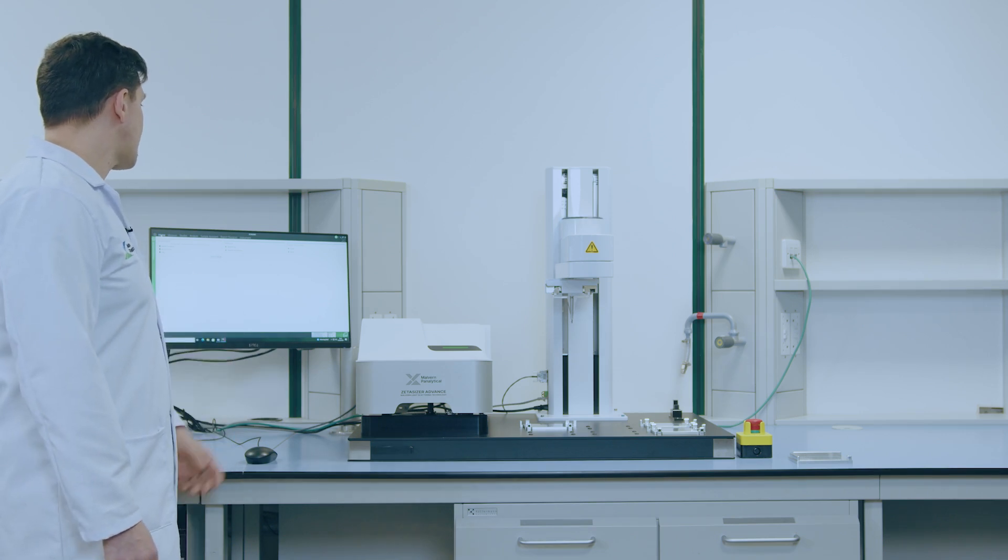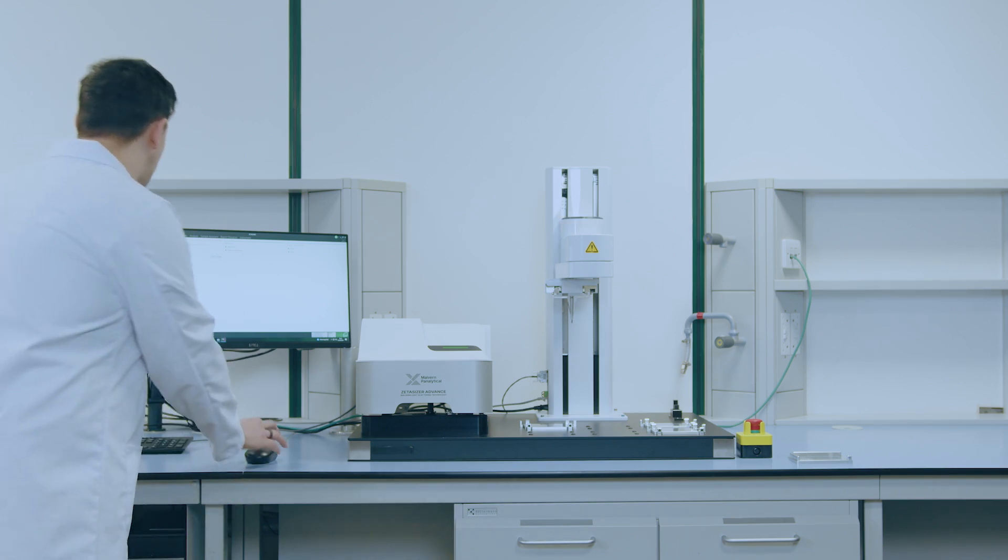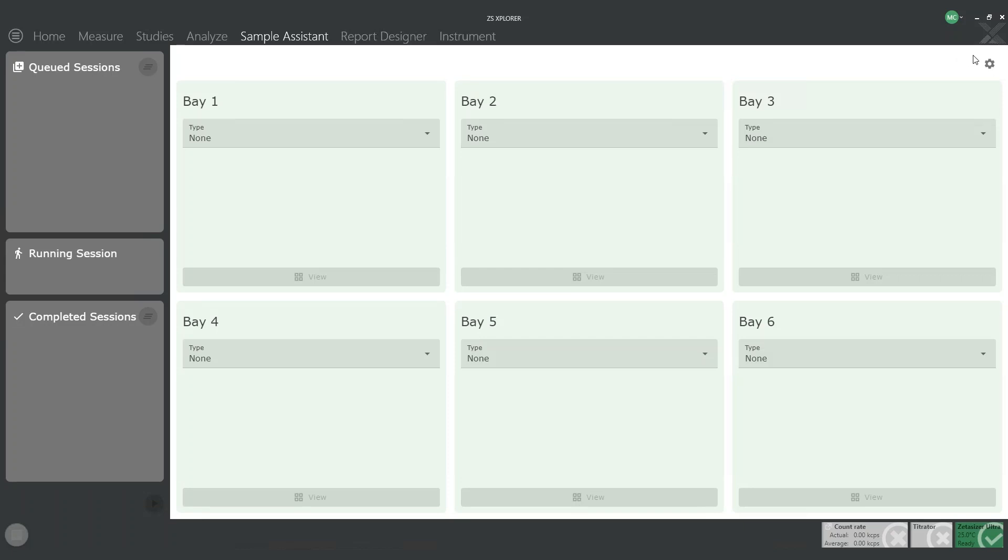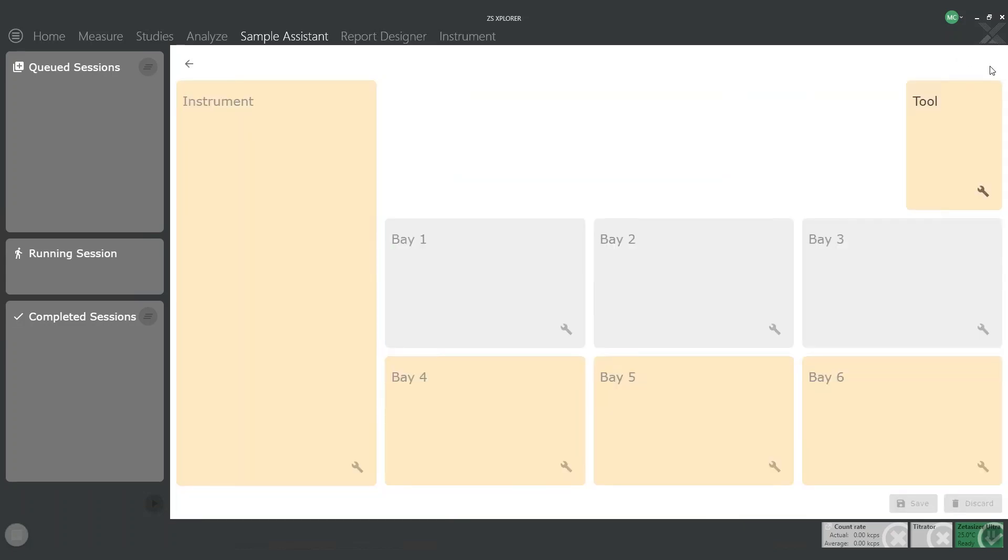The first step of your configuration is opening your Zetacizer Explorer software and navigating to the Sample Assistant tab. Once in the Sample Assistant tab, you will have to navigate to the configuration page where you will be able to configure the tool bay position, the Zetacizer instrument position, and all the trays that you have installed on your base.